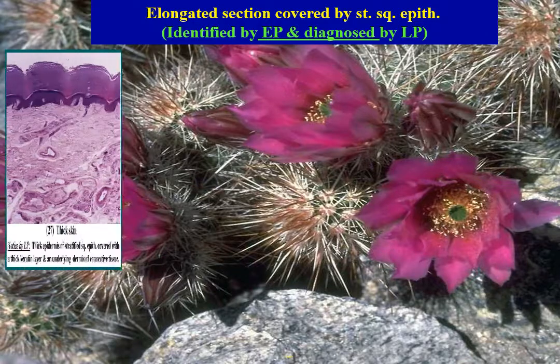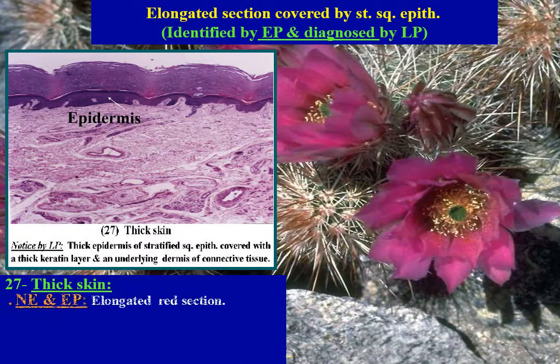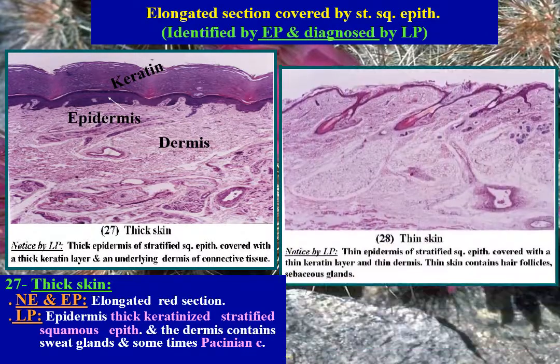Skin, thick skin. By eyepiece, it is an elongated red section. By low power, the epidermis is thick, formed of stratified squamous epithelium and has a thick keratin layer. The dermis is also thick.